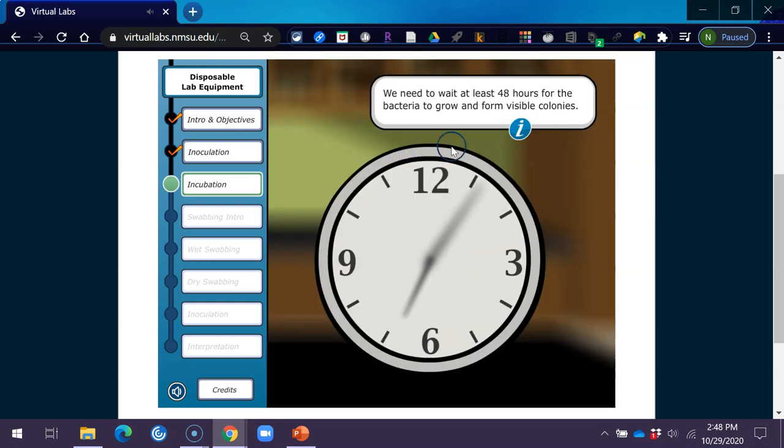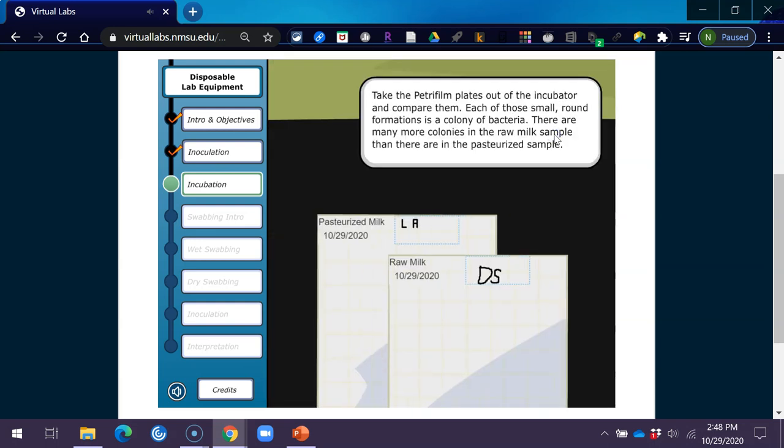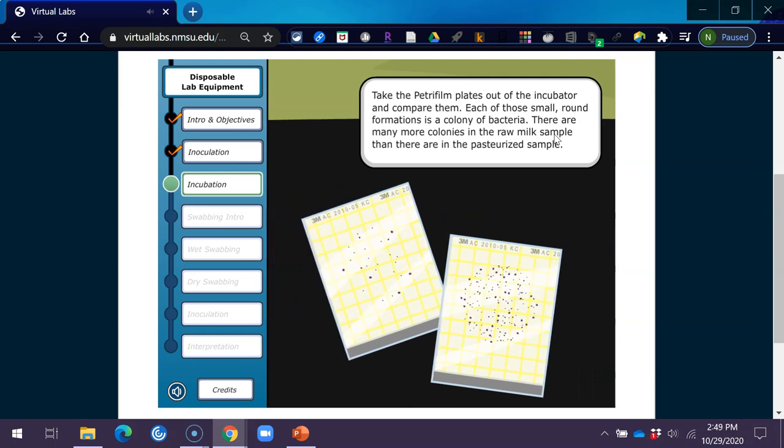We need to wait at least 48 hours for the bacteria to grow and form visible colonies. The national standard set for evaluating milk is 48 hours, which allows ample time for microorganisms to grow and form visible, sizable colonies. Waiting more or less than 48 hours will result in few or no colonies, or too many tiny colonies that are hard to count. After incubation, each small round formation is a colony of bacteria. There are many more colonies in the raw milk sample than in the pasteurized sample.